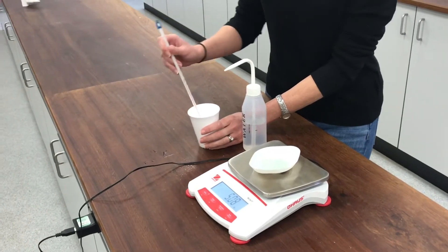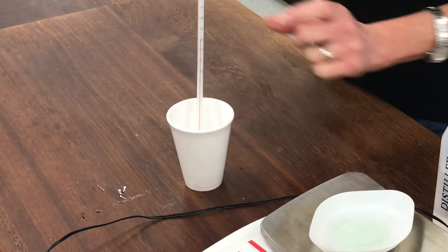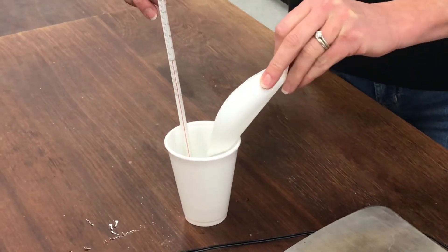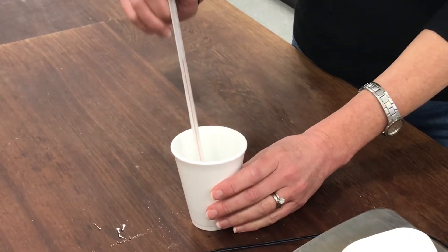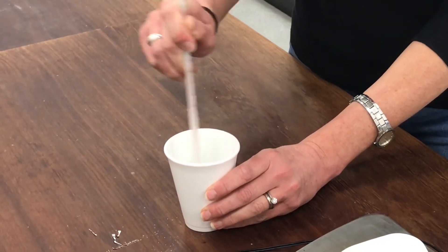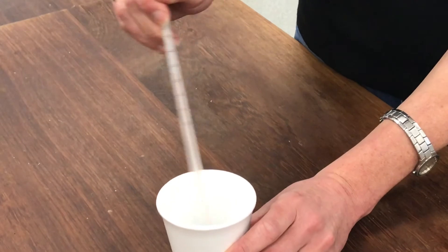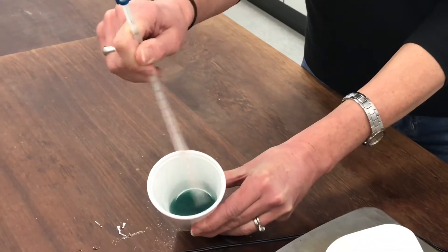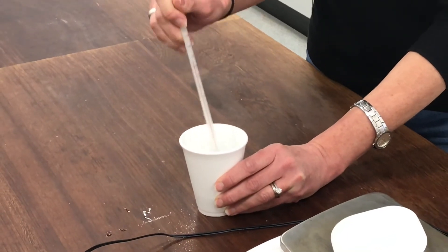At the moment, the temperature is on 20 degrees C. I'm going to add my anhydrous copper sulphate to it now and give that a good stir. You can see what's happened to the temperature — it's already changing. And you can also see the colour inside the polystyrene cup starting to get that classic deep blue colour that copper sulphate solution has.